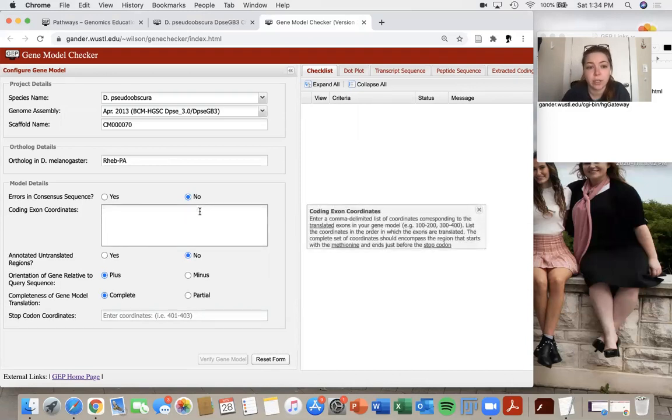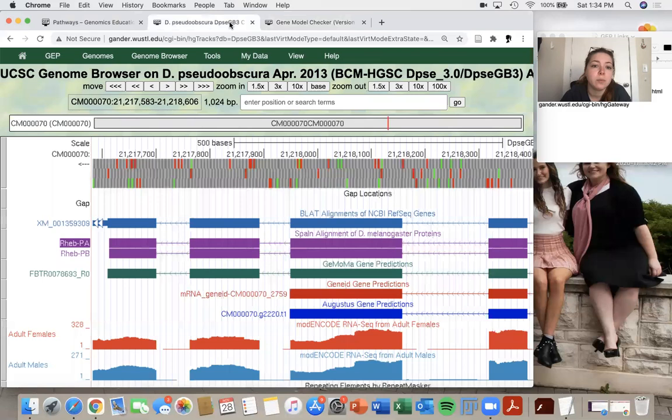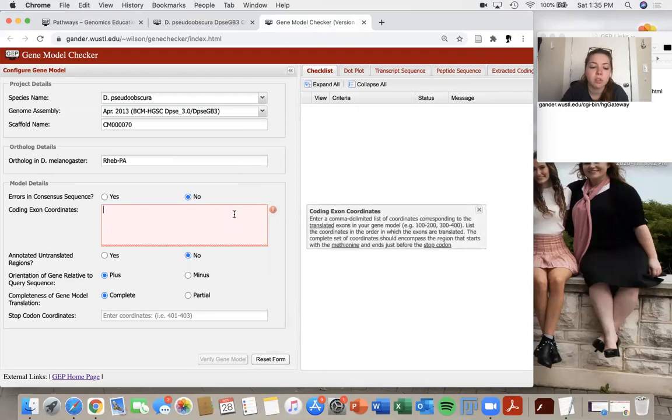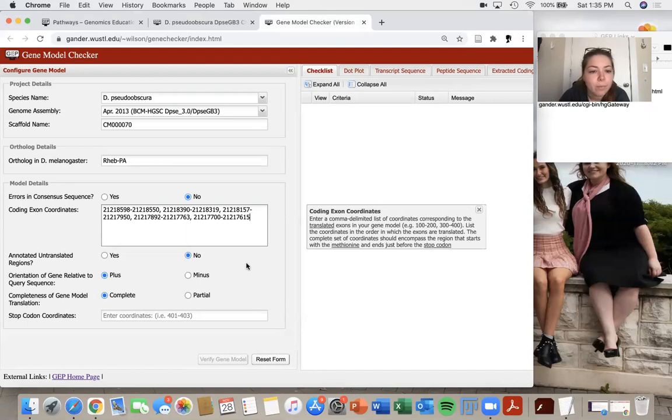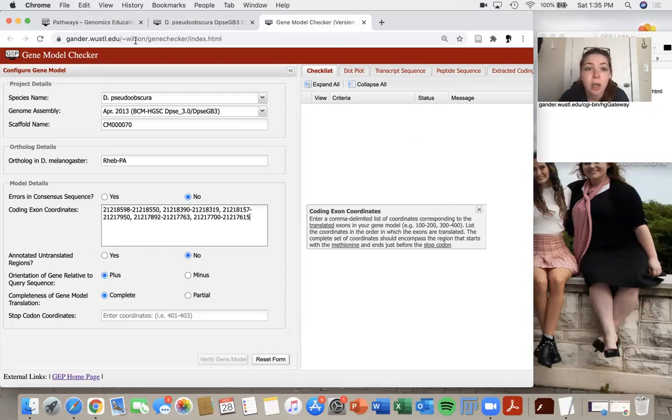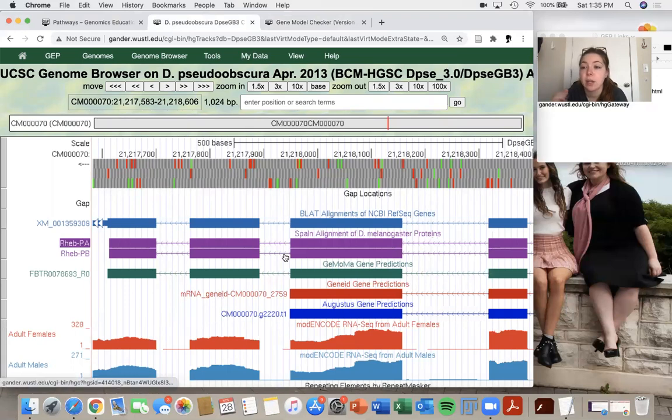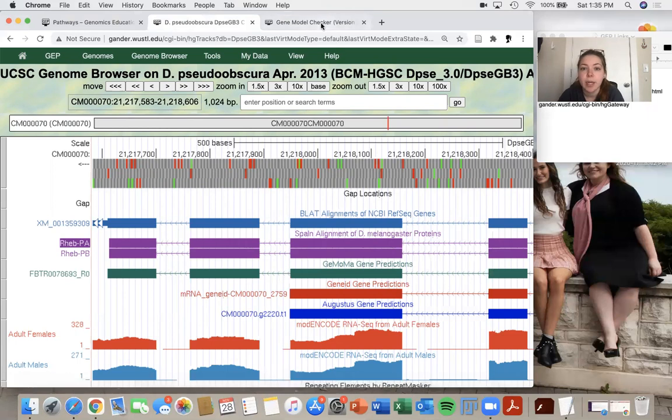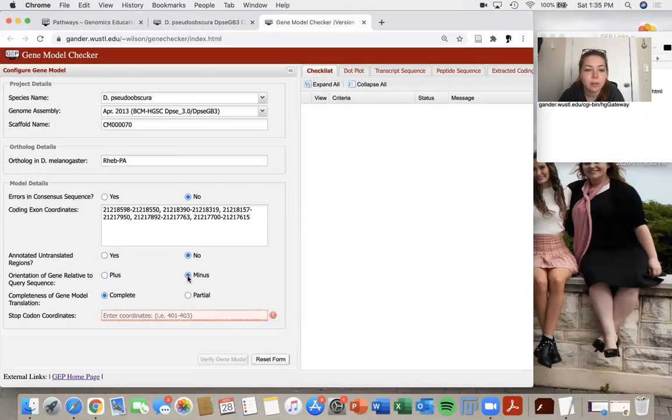So coding exon coordinates. So these are going to be the coordinates that you previously found during when you were annotating. And you can also go and find them this way on your genome browser, but I already have mine. So I'm just going to type those in there. And so then we will determine what strand was I on? And we talked about that earlier. I'm on the minus strand because my introns are pointing to the left and I already flipped my track. So now I'm going to click over here and select minus.